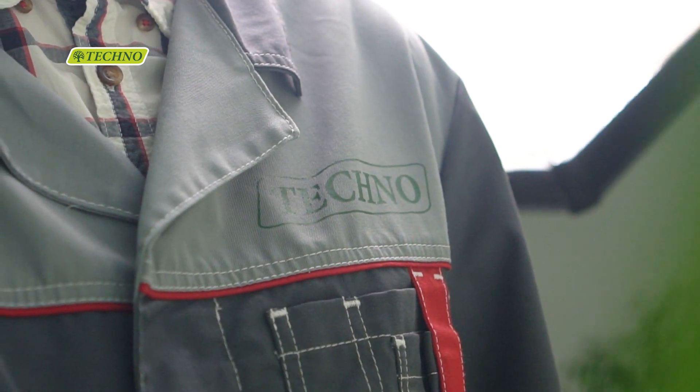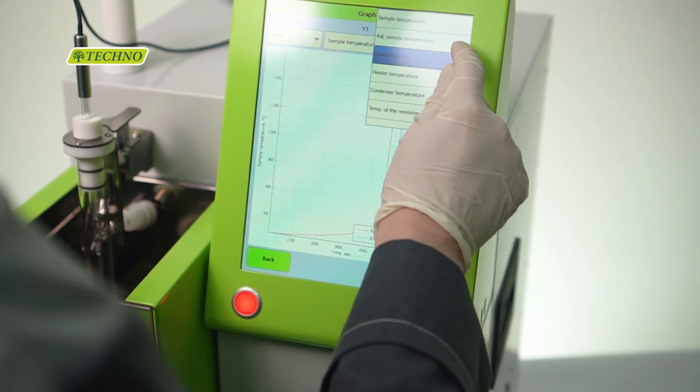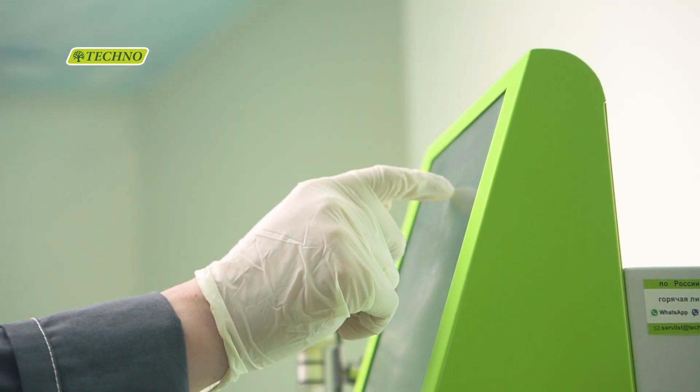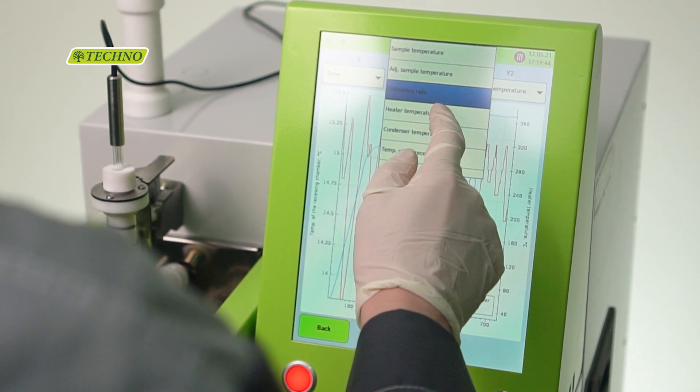An intuitive software interface on a wide 10-inch touch display with a multitude of hints and guides ensures easy operation. The software includes pre-installed methods, but an unlimited number of user-created methods can be added.